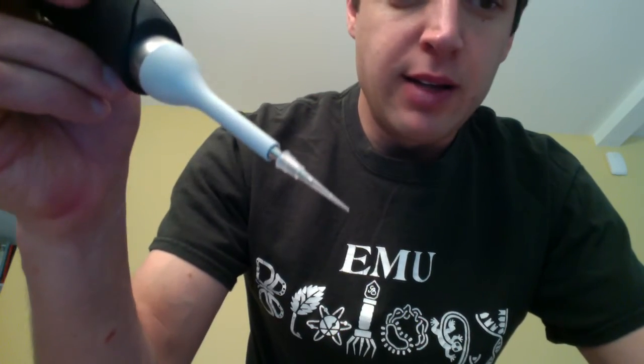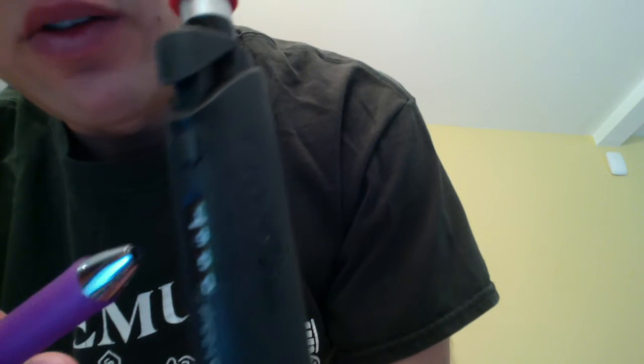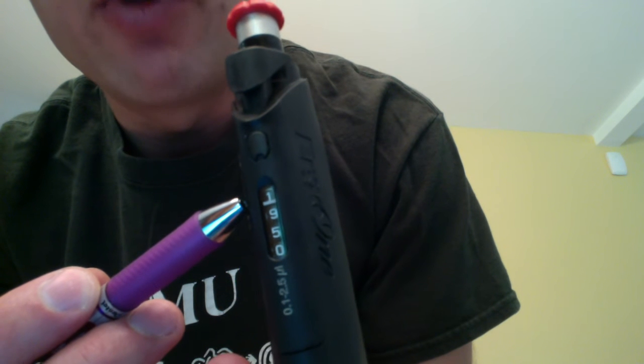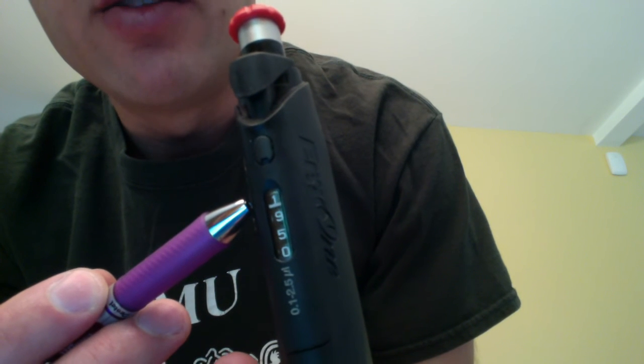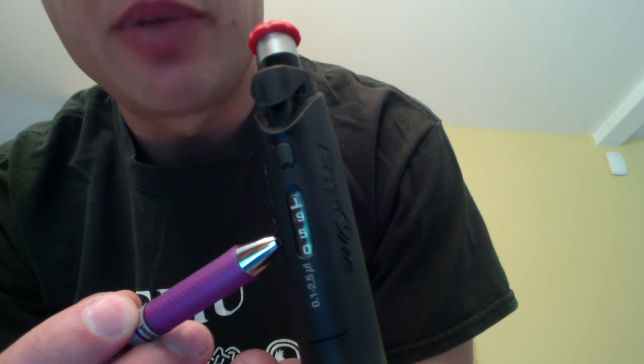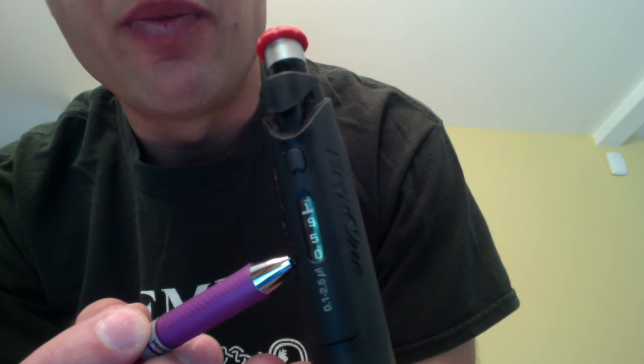Let's take a look at the digital displays of these micropipettes. This is the 2.5 microliter micropipette with a red button. It's meant to use these small clear microliter tips. You can see that's the tip that's used. The display has four digits on it. The top digit is the ones place, and there's a line between the ones place and the three lower places, meant to distinguish between whole microliters and fractional microliters. So this is the ones place, the tenths place, the hundredths place, and the thousandths place.